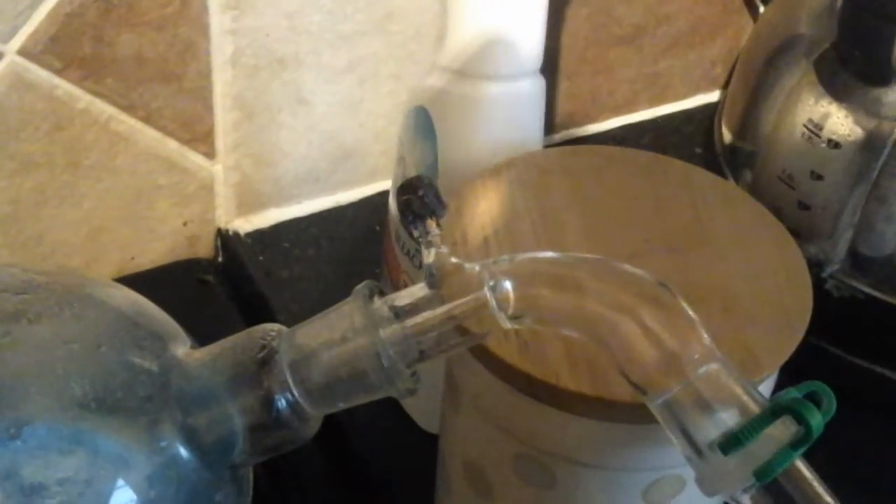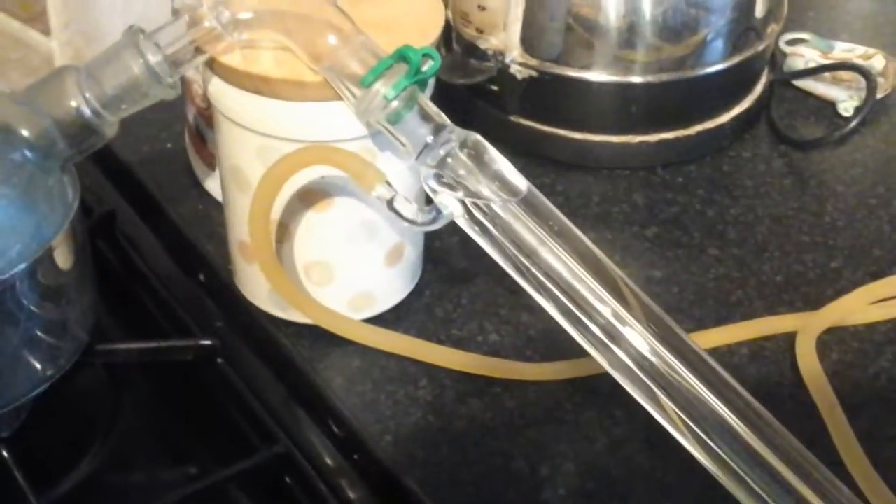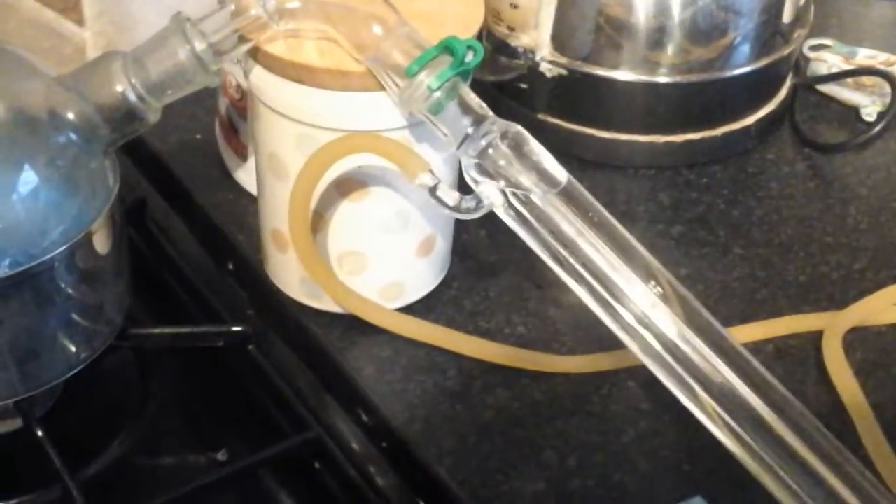I don't really know what that port is for — I think it's for doing vacuum distillations but I don't do those. The condenser is the one that is in backwards, because that's just the way it fits together when you're using the wrong labware.